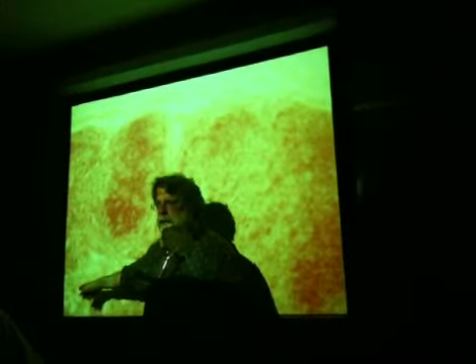This is called the trabeculae. That's another space. If it's in here, it's called a sinus, medullary sinus. If it's up here, it's the trabeculae. Actually, it's not just a space, but anyway, it looks like this.